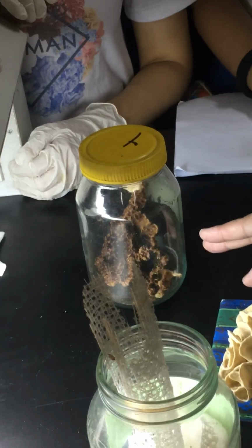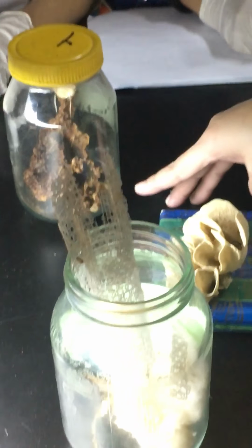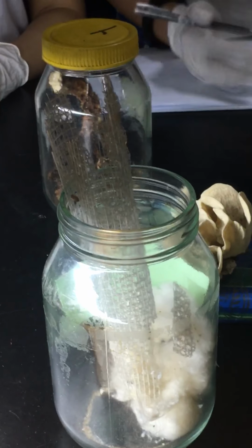So all the canal systems are represented by the class Calcarea. This, Leucosolenia, is not that nice anymore. But anyway, this is an example of an ascon type of canal system. That means it is just a single straight sac.